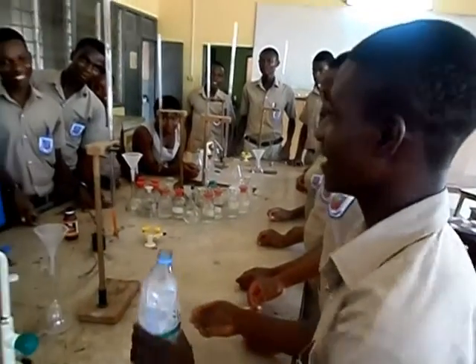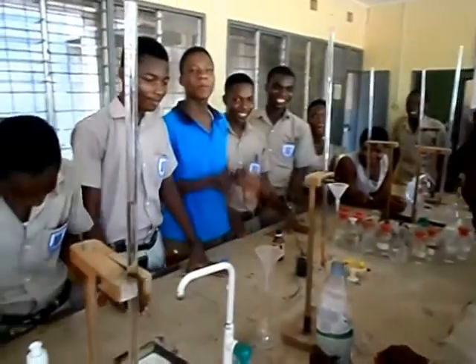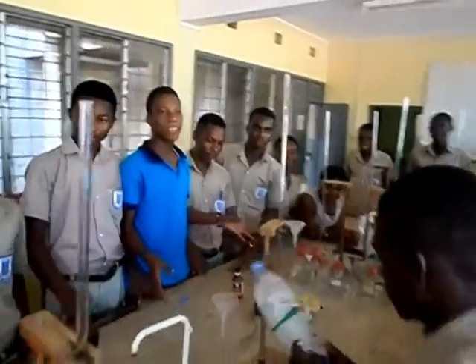We were preparing our oxygen using low-cost materials.